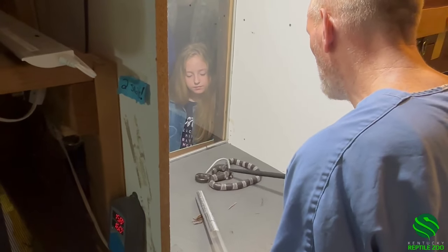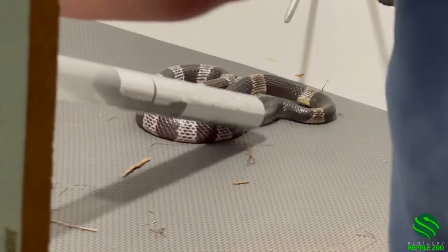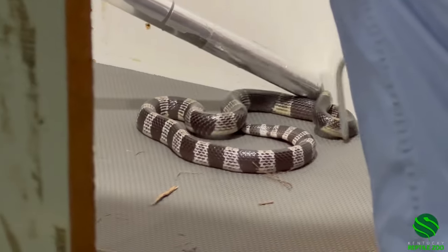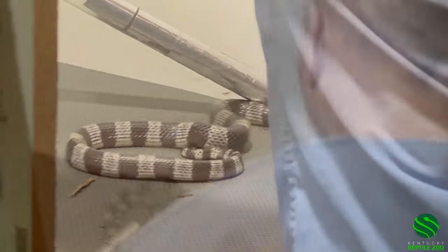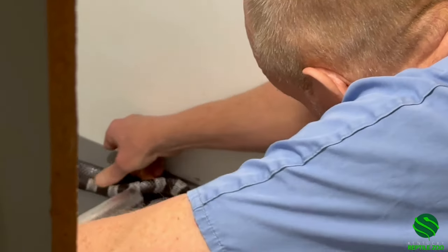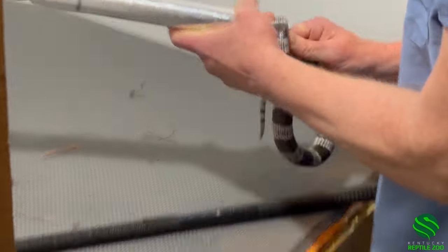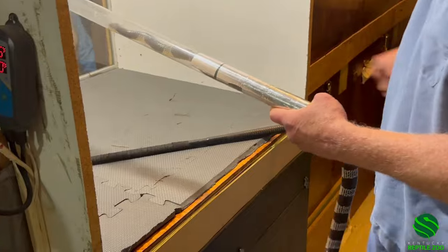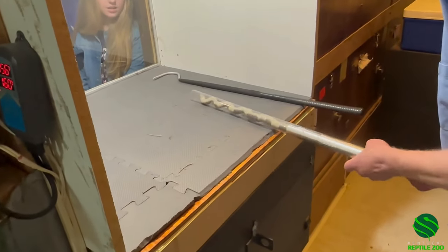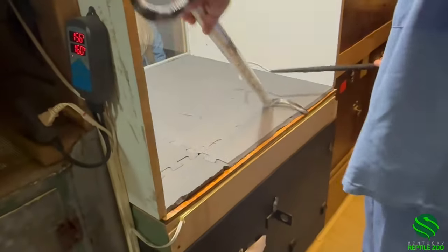Maybe if I had started with that it would have worked better, but now that it's all riled up it's just coming in. And my wife says I don't have any patience. They are so good at not doing really much.